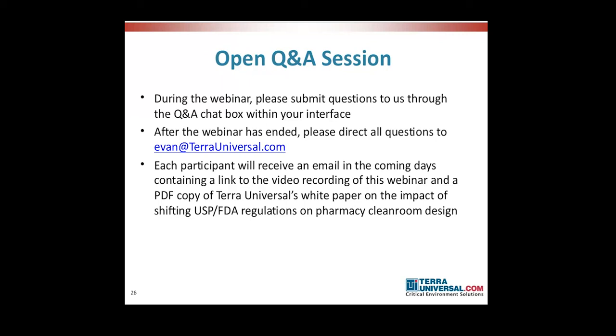Thank you, Dr. Munoz. And another question that is right up your alley. David asks, do you recommend switching the most common disinfectants in my lab from IPA or bleach or hydrogen peroxide? Does the USP or DQSA recommend other disinfectants? I mean, we always see 70% IPA.